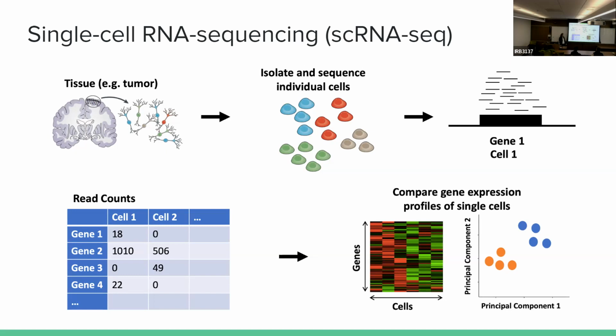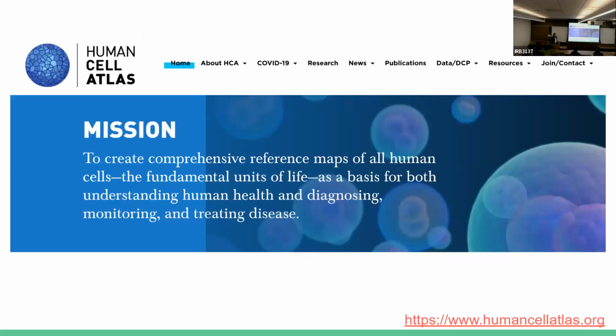So for example, we could plot gene expression and see which genes are differentially expressed maybe between cell types. We could apply dimensionality reduction techniques and see how they are different in some kind of low dimensional space, maybe a linear space, such as principal components analysis, and so forth. All right, that's single cell.